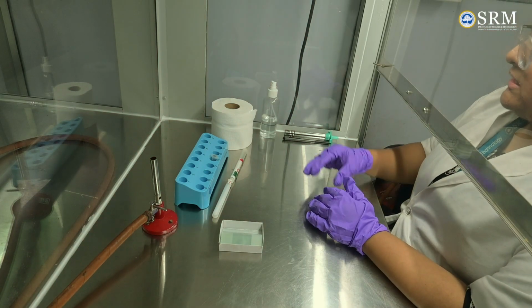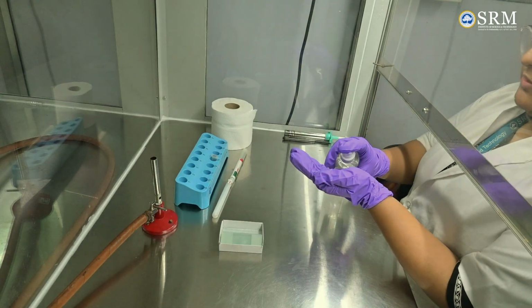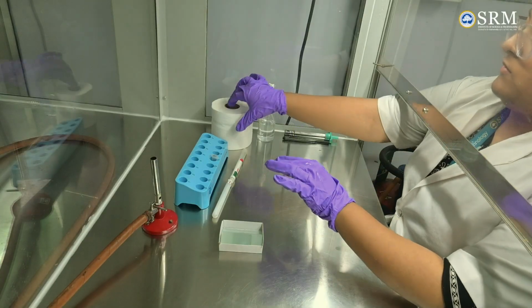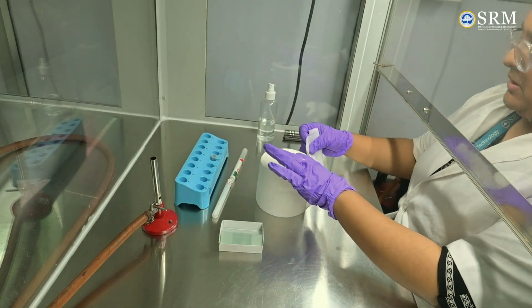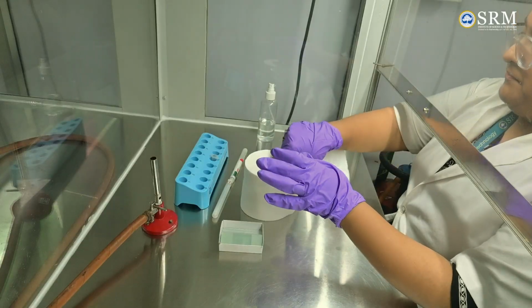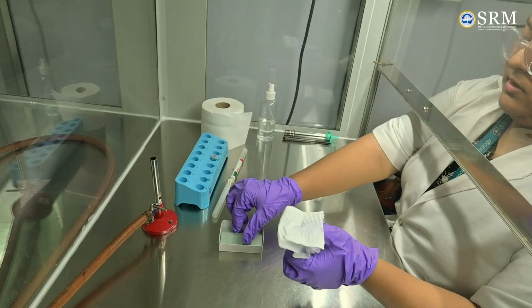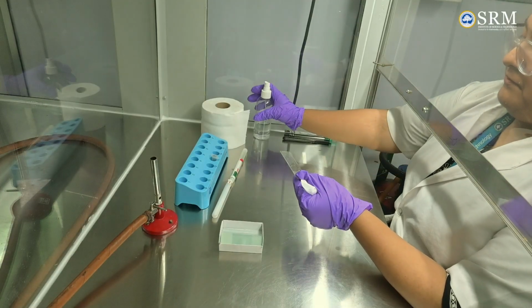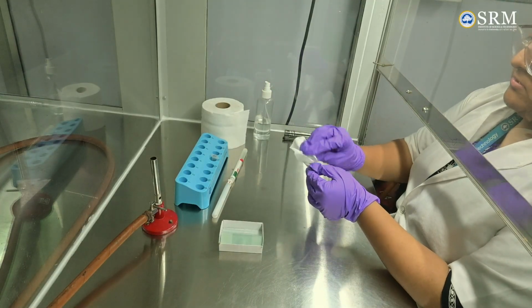So now under sterile conditions, we start the experiment by first wiping our hands with alcohol, taking some amount of the blotting paper, cleaning the slides with alcohol on both the sides.